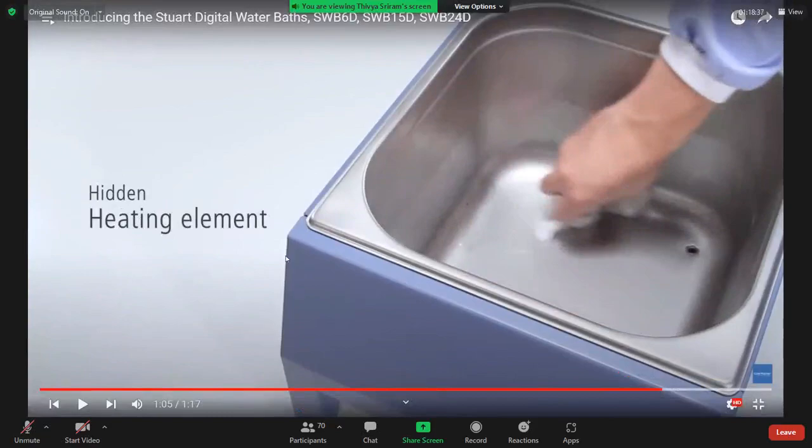In the water bath, before we place the sample inside, we have to add water inside the water bath up to the optimum level. Otherwise, the alarm sound will be audible. The alarm will say that the H2O level is not enough. Like that, the error sound will be audible. After that, we have to check whether the water is at the optimum level or not. We have to fill up to the optimum level, and we have to wait until it reaches the particular temperature. After that, we have to place the sample inside the water bath.